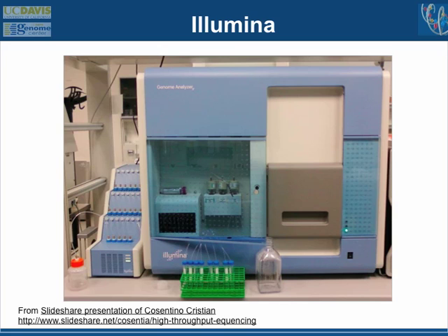But when you're moving into PCR amplification of your DNA samples, a lot of these methods are also being used for ribosomal RNA sequencing from environmental samples of microbes. And then you're running a PCR reaction to even generate your initial sample of DNA, and then you run an emulsion PCR to get even more of each of the ribosomal RNA samples.